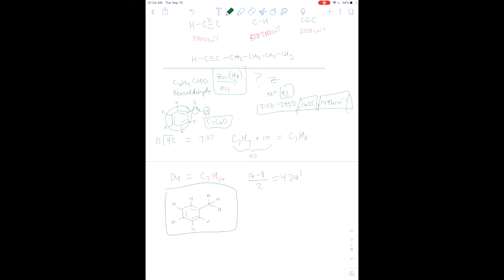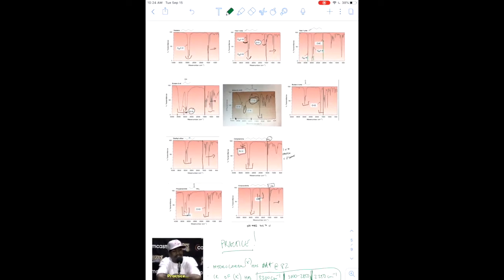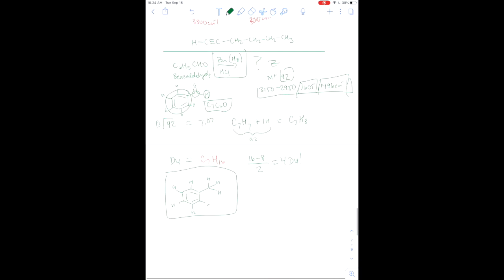All right, so again, this is going to take some practice. So take a look at the chart as well as the spectra that I have shown you. There's plenty in your book that you can refer to. And then you can also use that spectral database to search molecules on your own to take in more spectra. That way when you see something, you'll automatically recognize it and you'll know exactly what it is. And if you have any other questions, please let me know. This stuff is really fun. You just gotta go in with a positive mindset and enjoy the process, because it is a process.